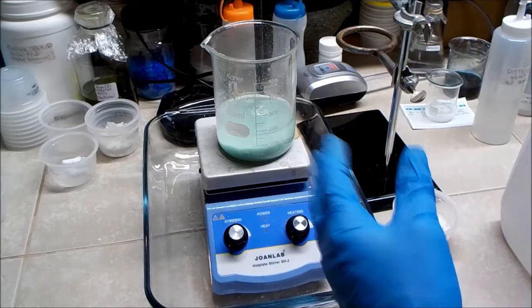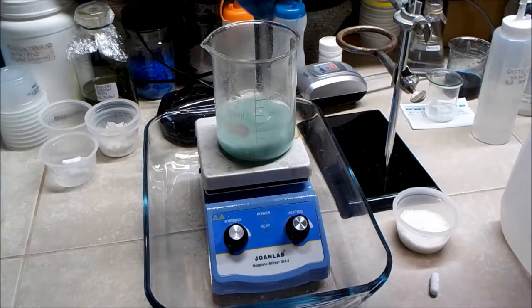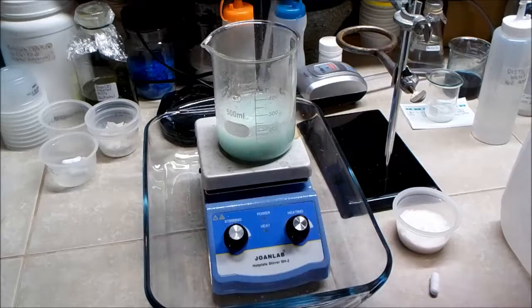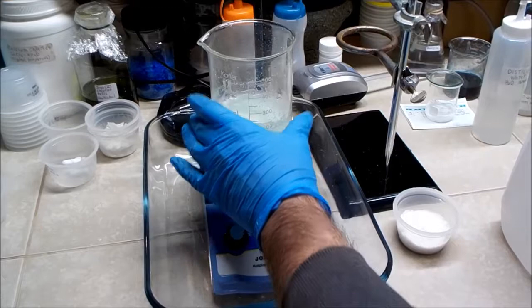That looks like about 175 milliliters along with the powder. And probably I'll add some more water in a minute. So I'm going to put in a stir bar. See if I can get that to go.